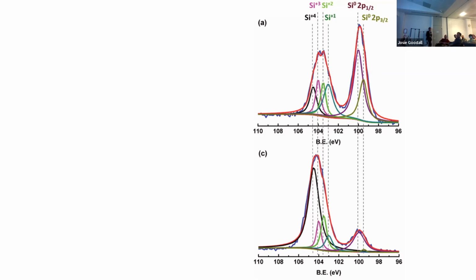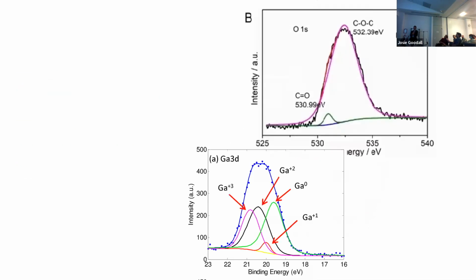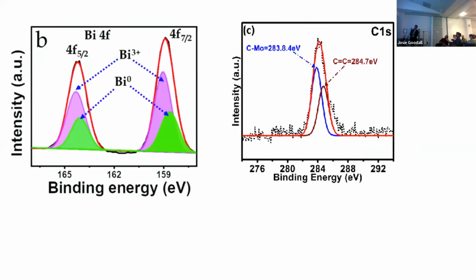I have a question online, which is about the doublet peak of bismuth that you can demonstrate. Is it possible to treat each peak as a single peak, while considering the start and end of the peak? Absolutely. If they mean setting up regions, so if you want to model it as two different regions, yes, exactly right. I think that's probably the best approach. If they use a linear background, it can be fine. Probably the best approach is to have two different regions, and then you avoid the background problems in the middle.